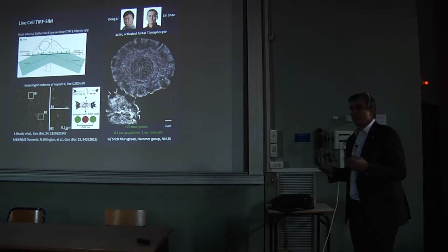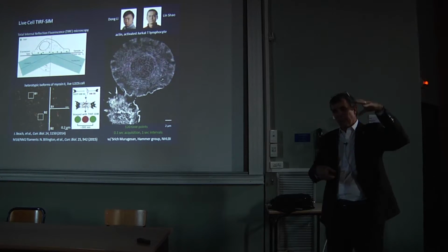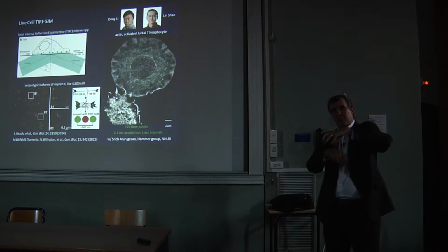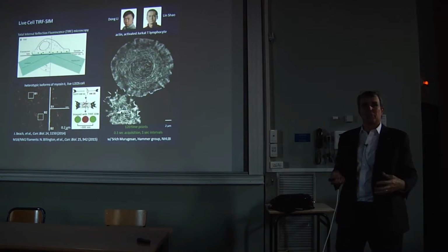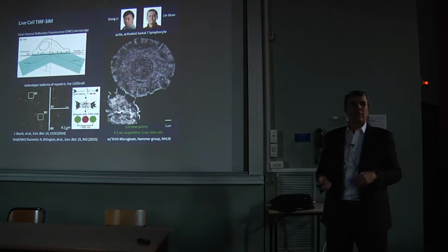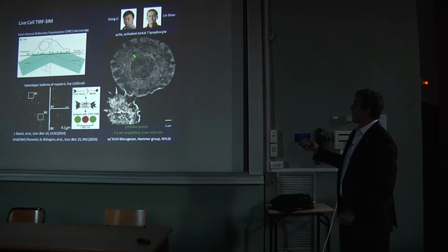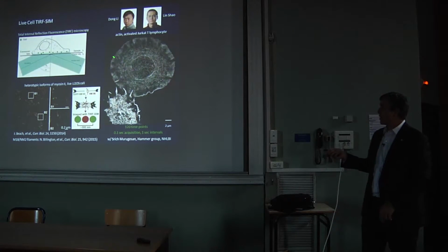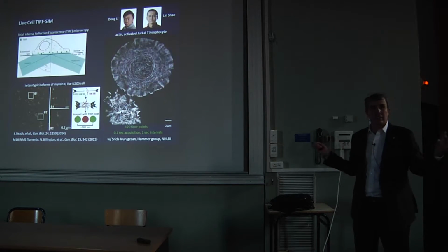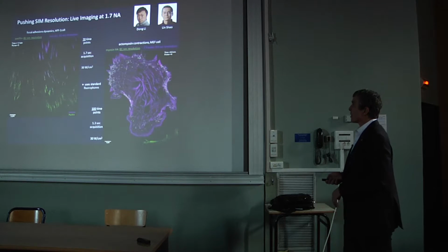This is looking at a T cell, such as will fight infection in your body, but it's plopped down on a coverslip that has antigens that provoke what's known as the immunological response, as if it were coming up against a target cell that it was going to try to kill. And then you can see this beautiful symmetry of the actin flow, the cytoskeleton, inside when that synapse is established.